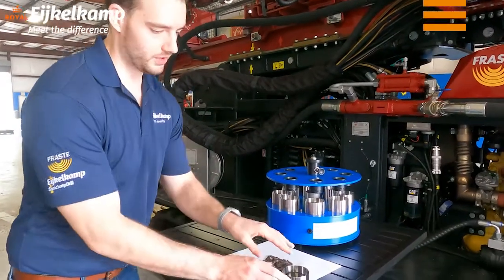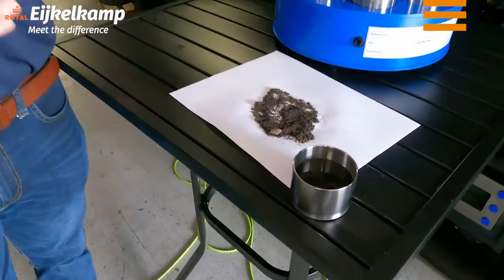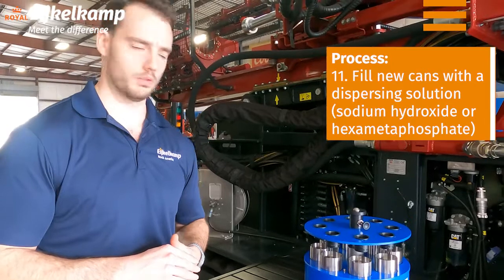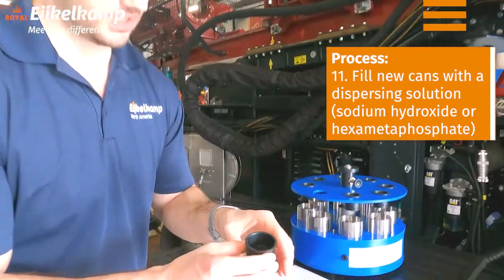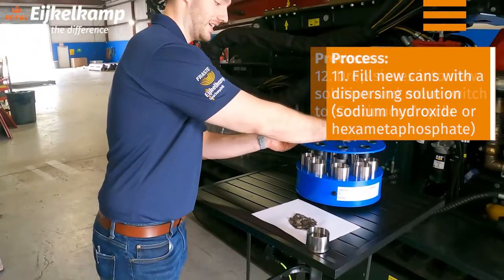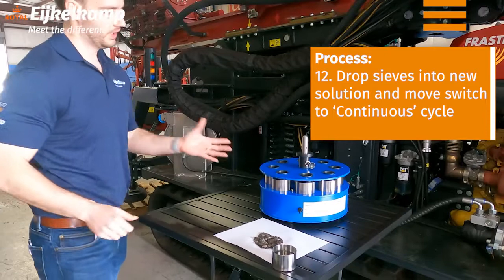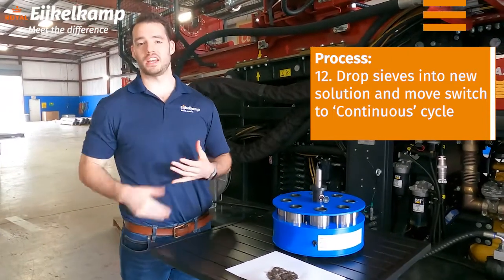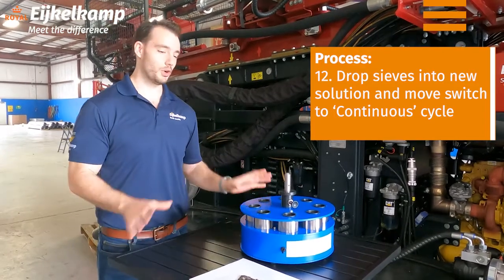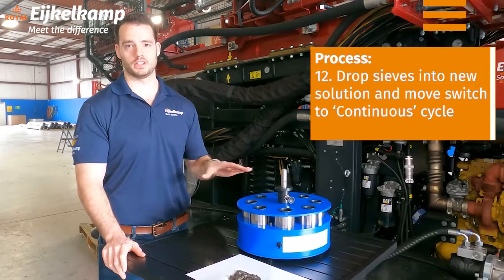We've done our three-minute wash and replaced the solution. You can see this can from the first wash is pretty dark — a lot of the fines from that soil sample have passed through the screen and are now in that stainless steel can. We replaced it with the new solution to adjust the pH. You can also see that a lot of the sample is gone. We drop it back down into the working location — all the soil samples are submerged again — and click it onto the continuous phase. There's no set time; anywhere from five to eight minutes. We'll hopefully see the remainder of the fines go through, leaving only roots, sand, or twigs. If needed, you can use a rod with a rubber tip to push remaining aggregates through to finish the process.